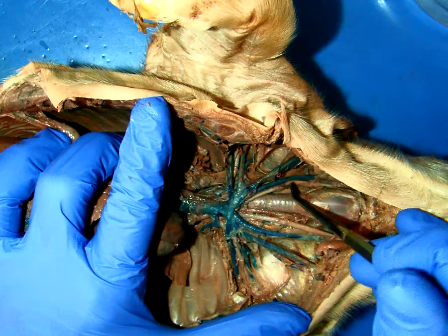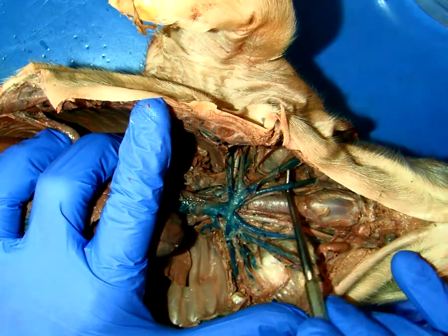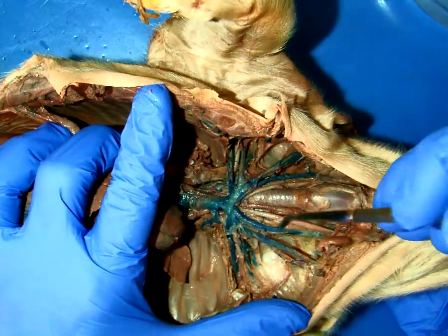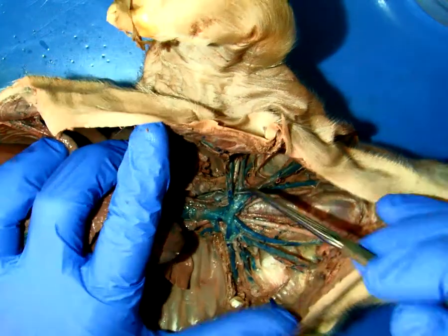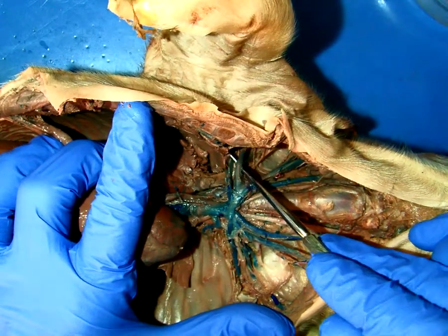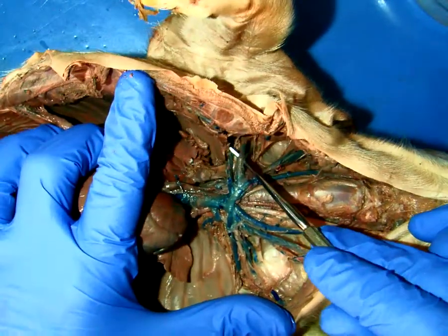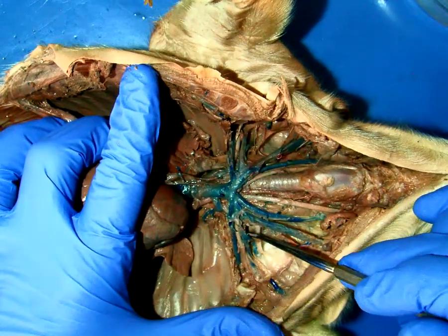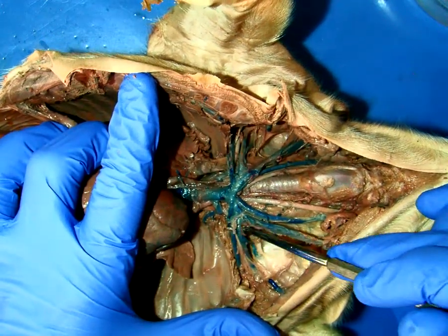But these would be the jugulars collectively: internal, external, left, internal, external. And then the subclavian would most likely be this vessel right here. So this would be the right subclavian vein, and I'm going to guess that that is the left subclavian vein.